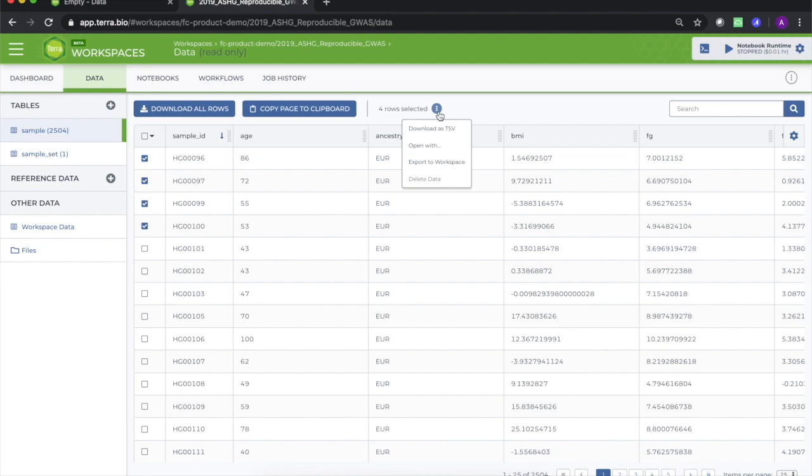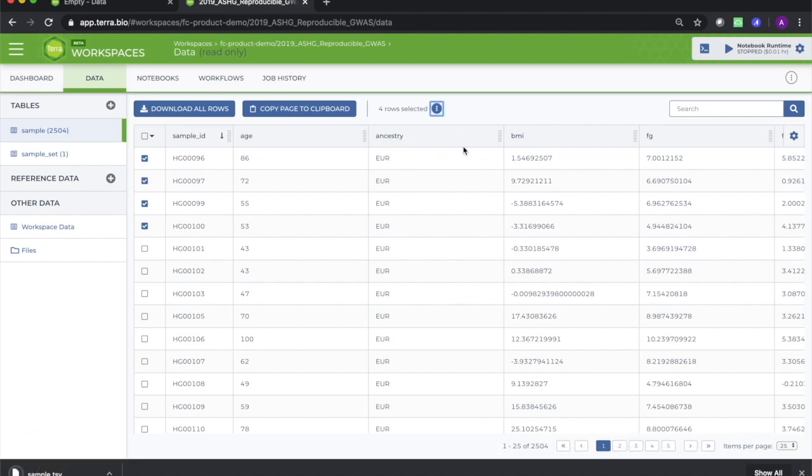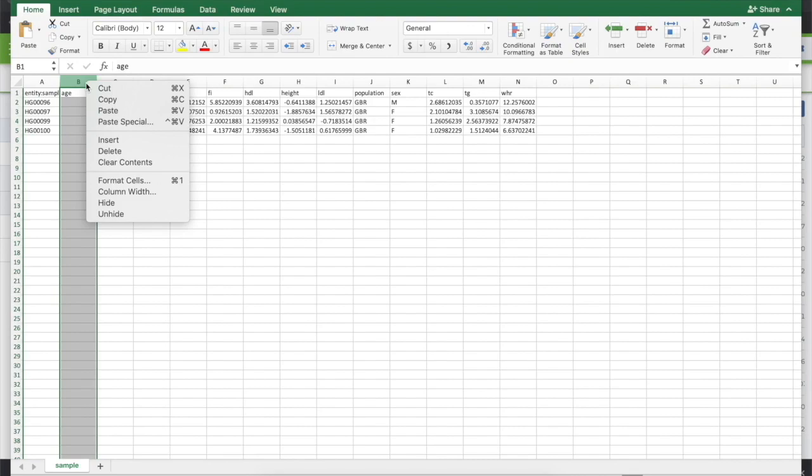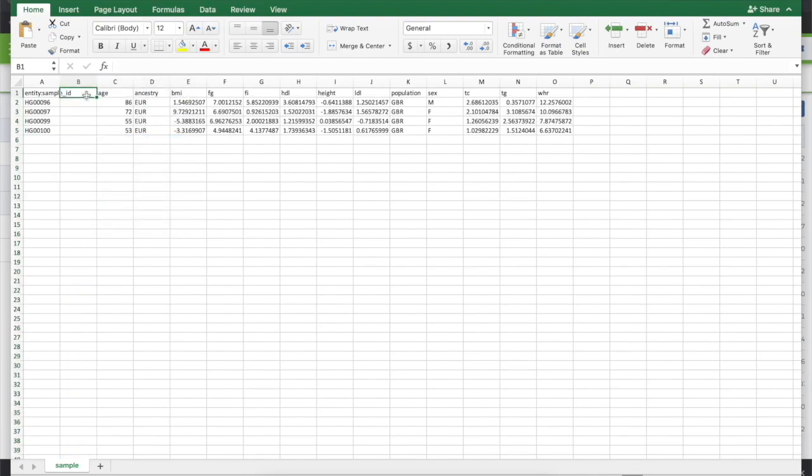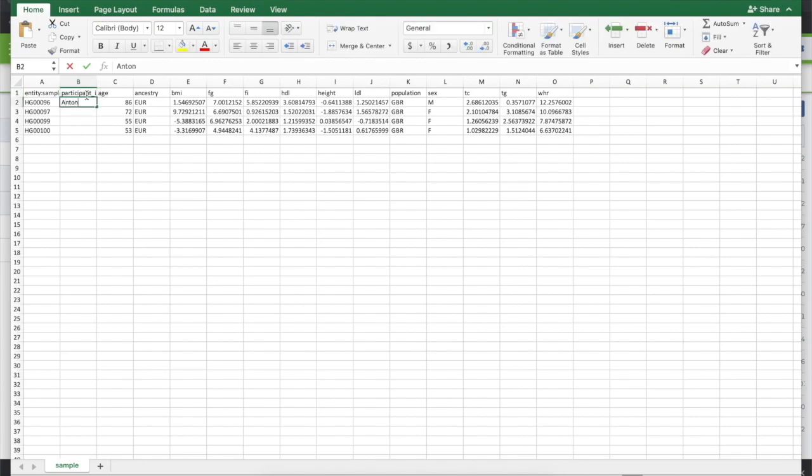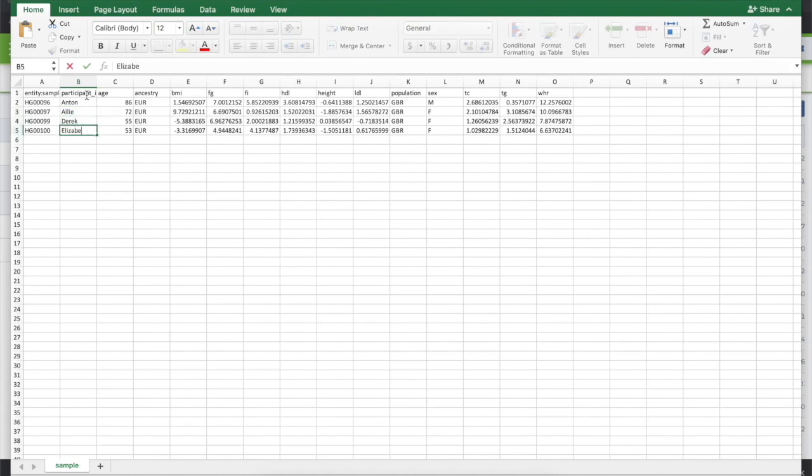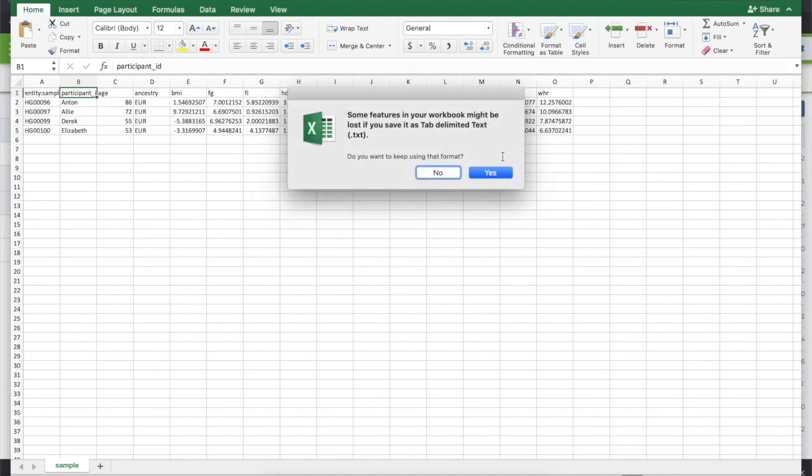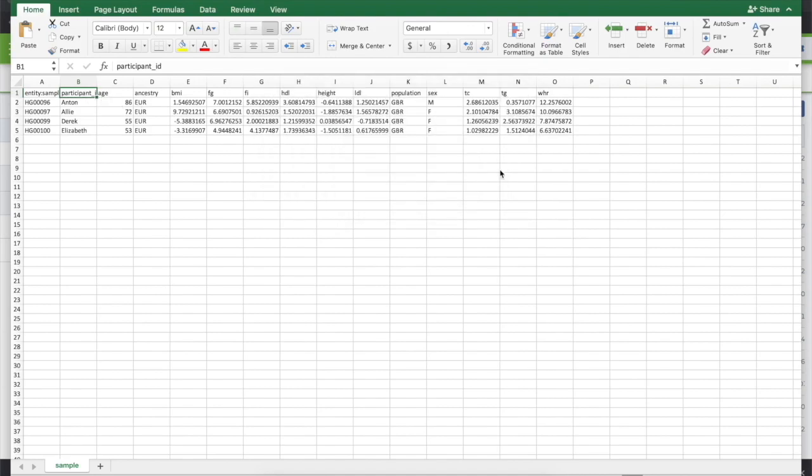Before we continue, let's quickly modify the table we downloaded to include a column for participant IDs, so that Terra will be able to make the association between the two tables. Simply insert a column anywhere to the right of the first column. Remember not to insert to the left of the first column, or your new column will become the new first column. And the entity type entry at the top left of this table would be wrong. The title of this new column should just be participant ID, and the fields under the column should contain the names listed in your first spreadsheet.